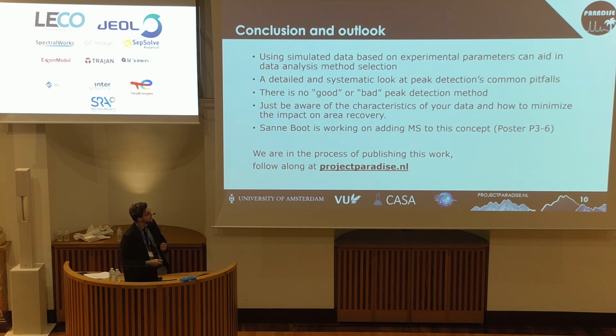And on top of that, I think it's very interesting that we can use this approach to also create these benchmark data sets, which is work that's already been published. It's also on our website, so if you want to play around with this simulated data, I highly recommend it, and I think it's a very interesting insight for anyone working with data analysis workflows.